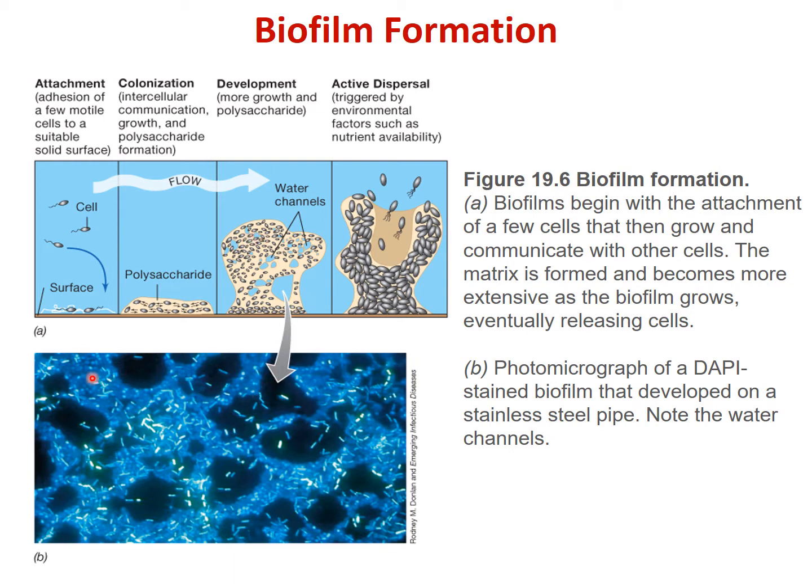You can see water channels in there, with all the cells stuck together with this polysaccharide material holding them together, and then these channels in between. This is a neat way of looking at bacteria. These are cells where the DNA has been stained with DAPI, and it will fluoresce blue.